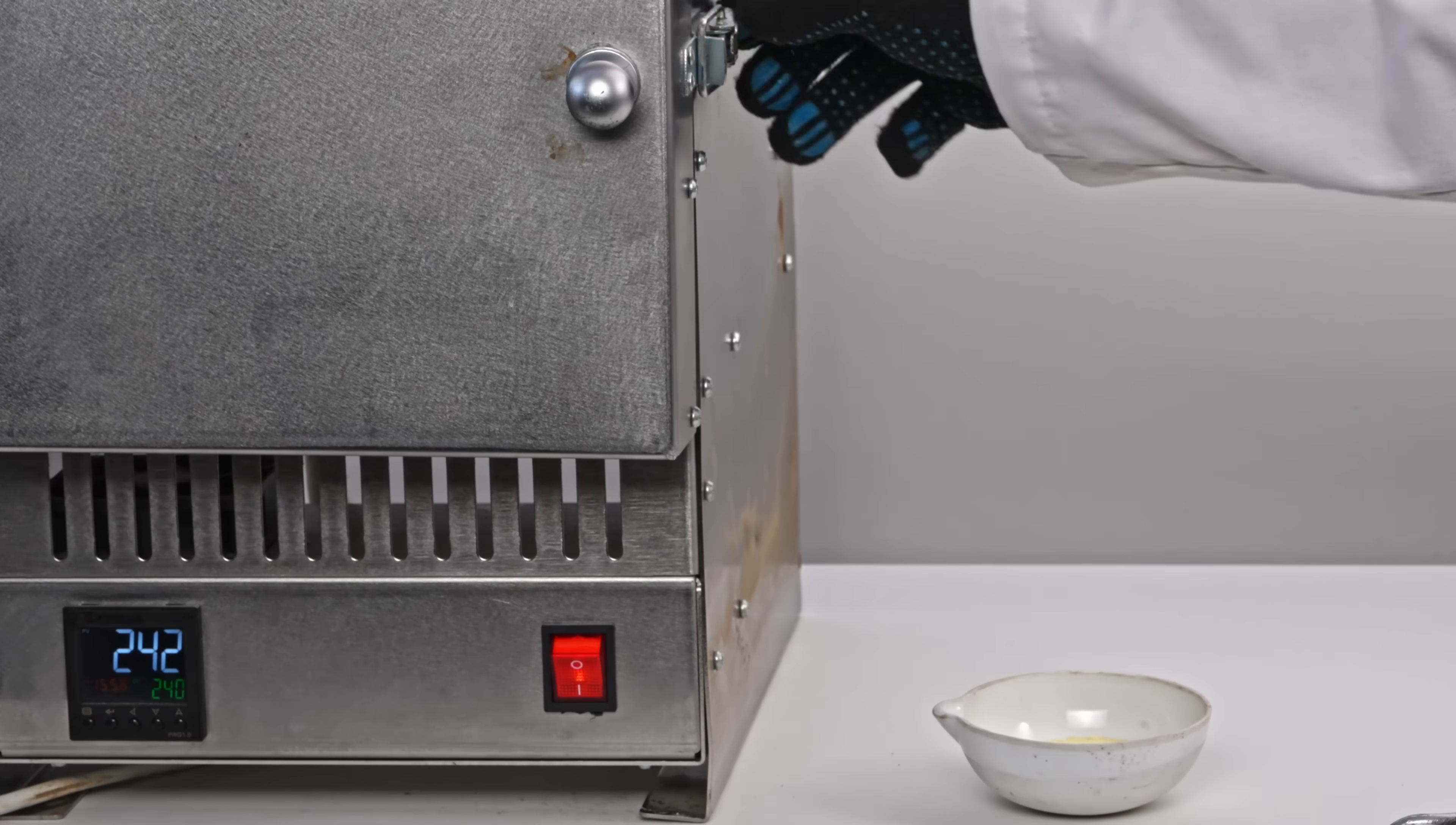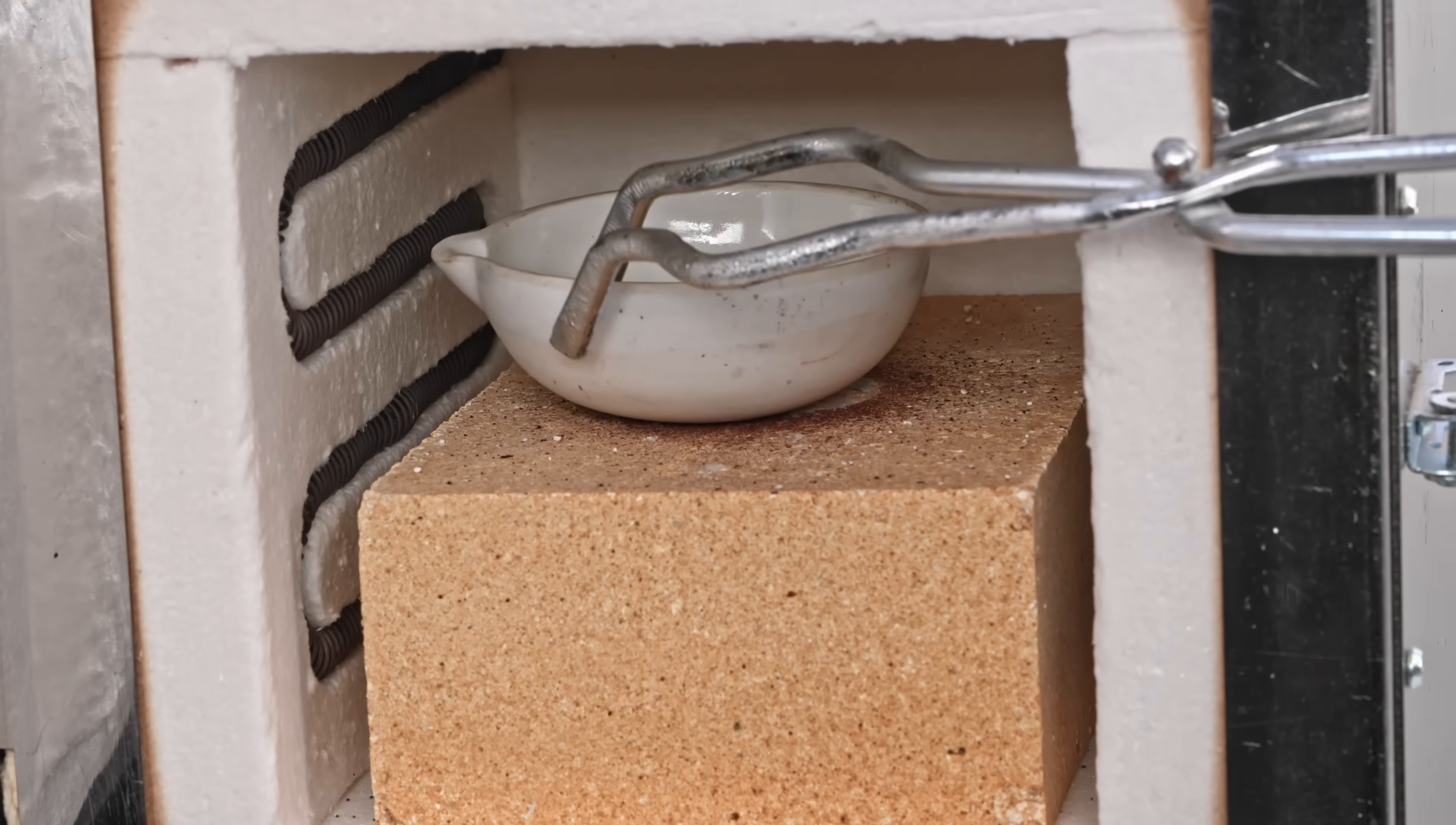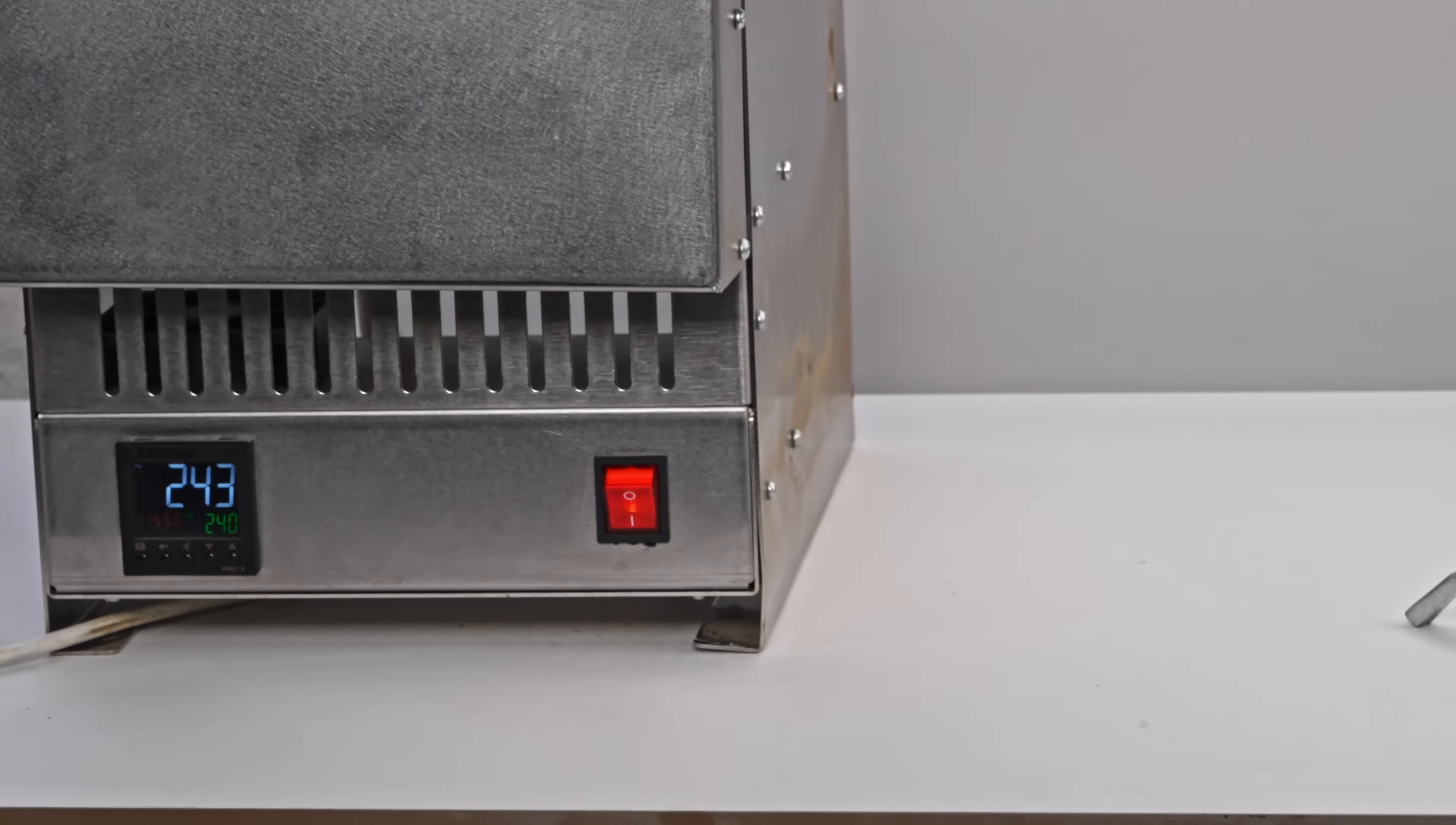To dry it, I heated hydrated salt to about 250 degrees Celsius. The heat removes the water, leaving behind anhydrous potassium ferrocyanide.